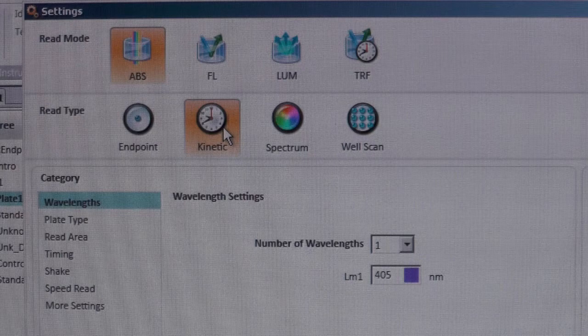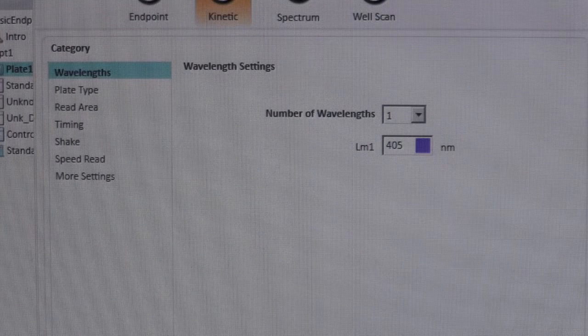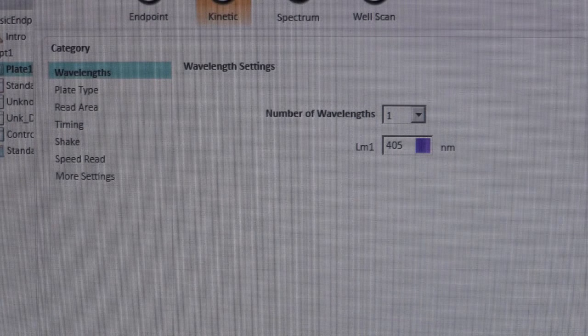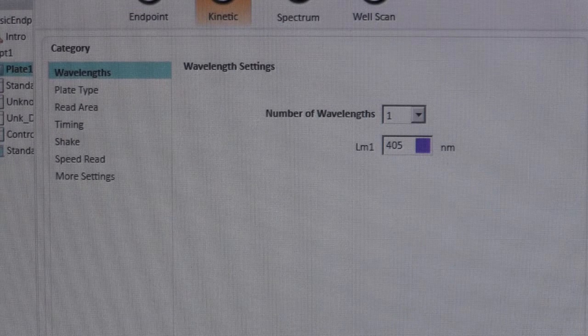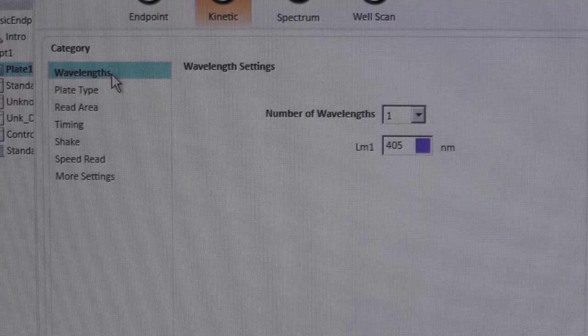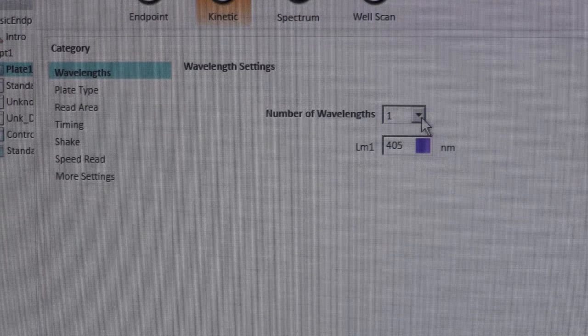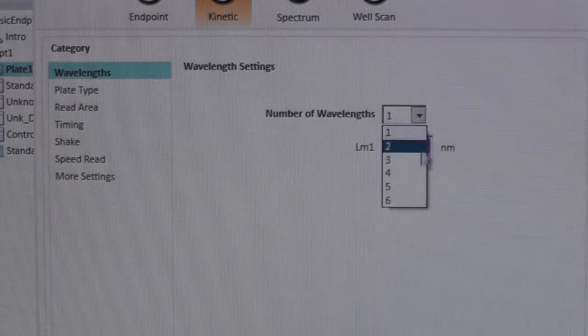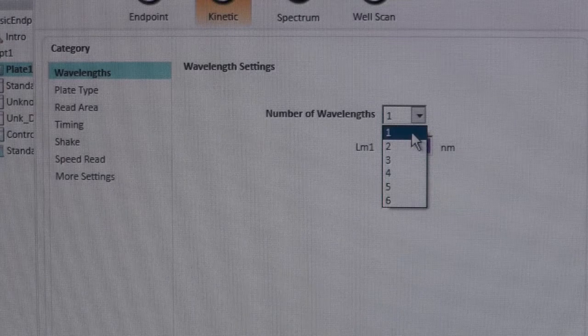First, click on the Kinetic icon. A list of all the adjustable parameters will appear in the left panel. Then select the number of wavelengths you would like to read your sample at. Up to 6 can be used, but here we will only use one.